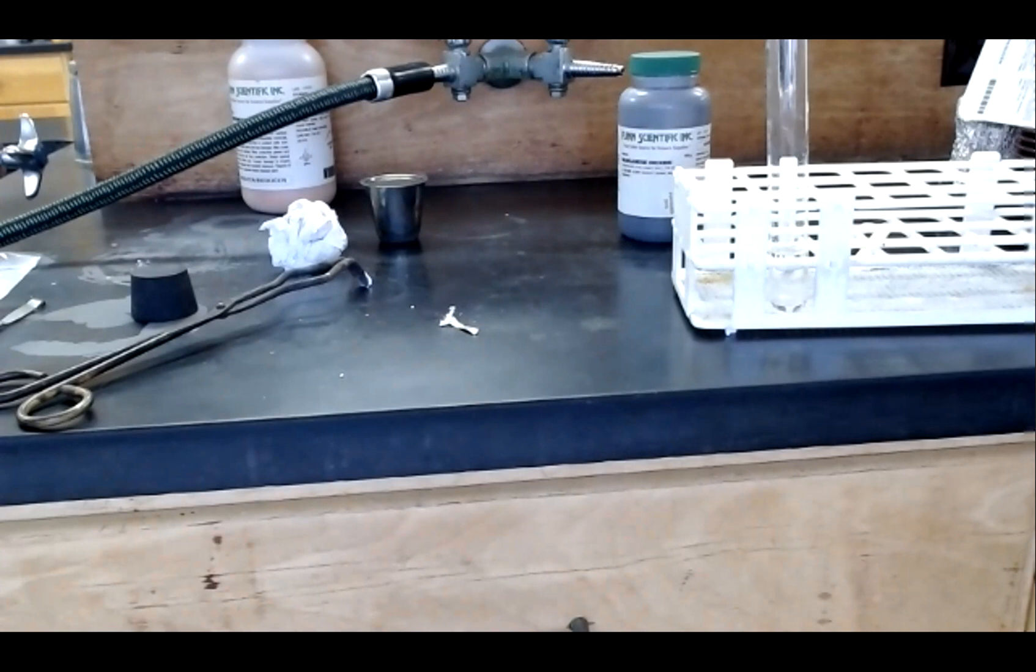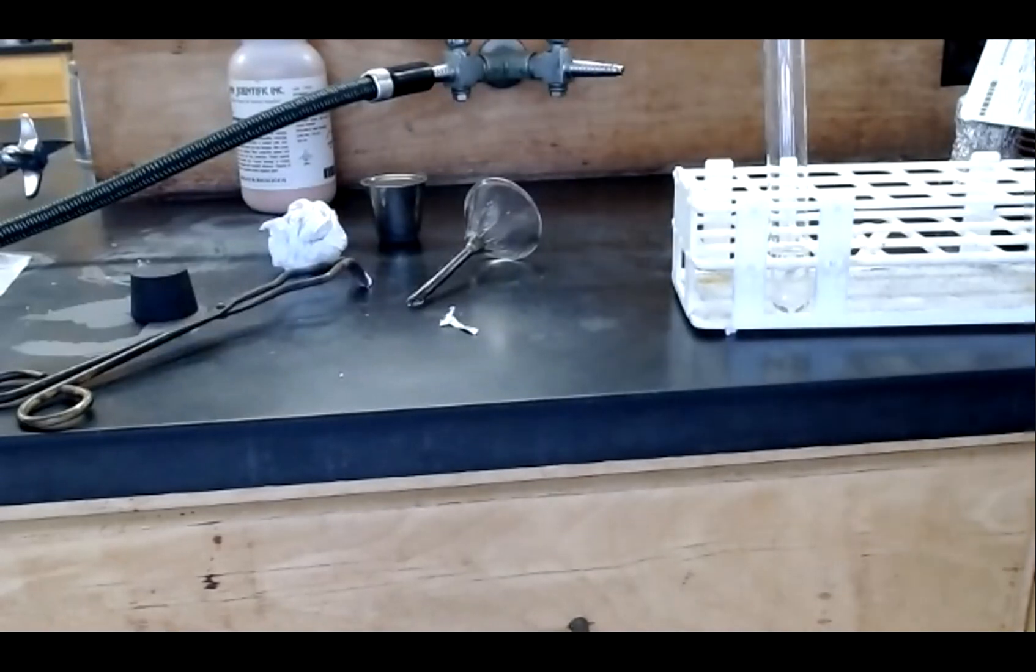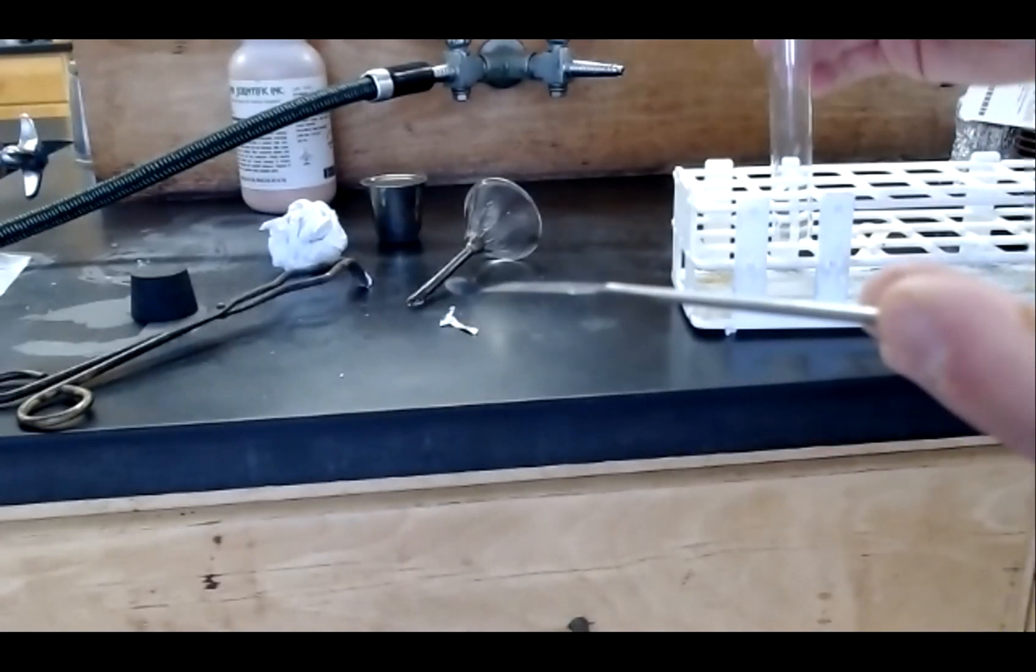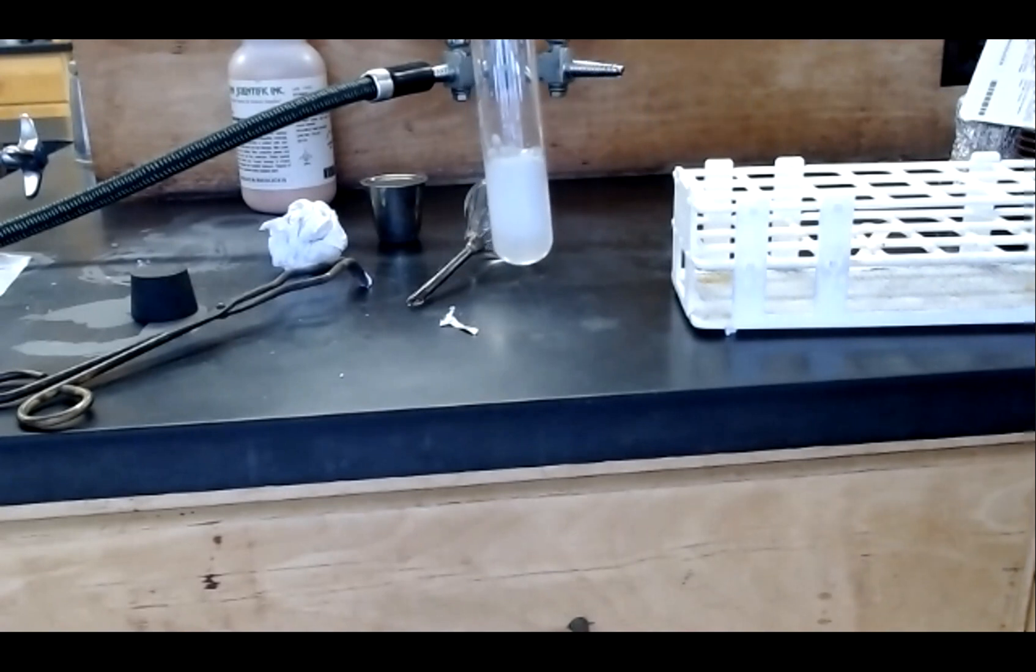And then I'm going to use a catalyst called manganese dioxide to decompose that hydrogen peroxide. A catalyst is a substance that speeds up a reaction, but does not itself get consumed in the reaction. As you can see, there's a very small amount of manganese dioxide on the end of the spatula. Putting it in, it causes the rapid decomposition of that hydrogen peroxide.